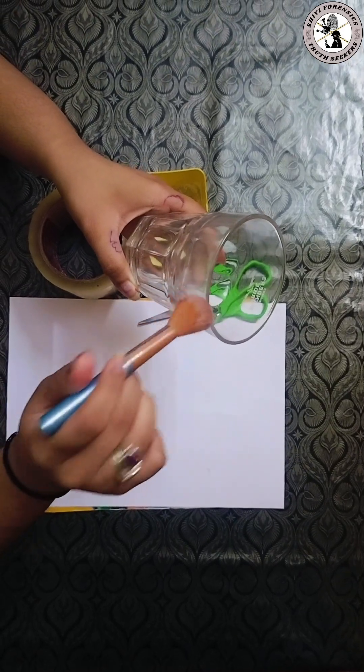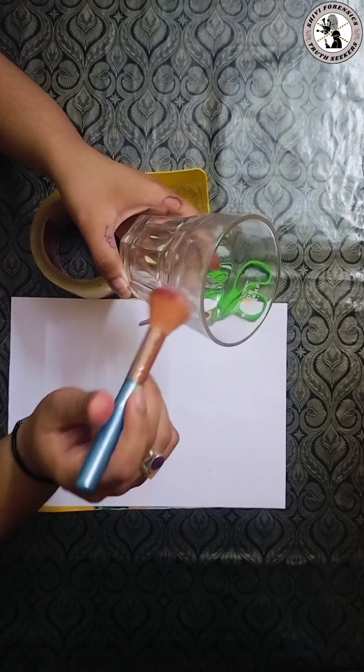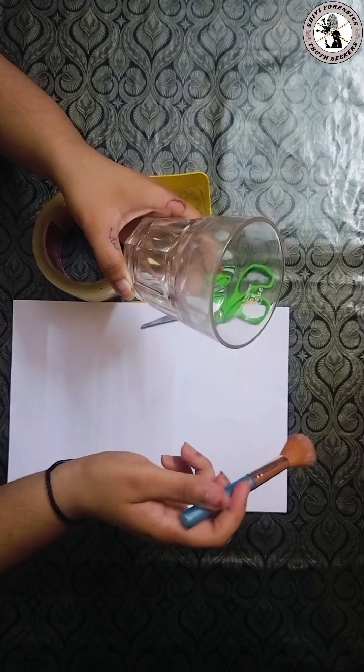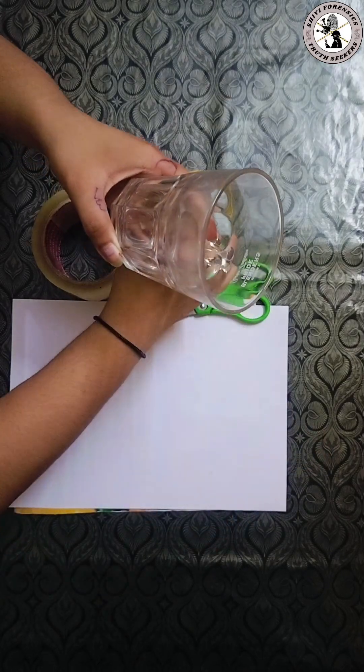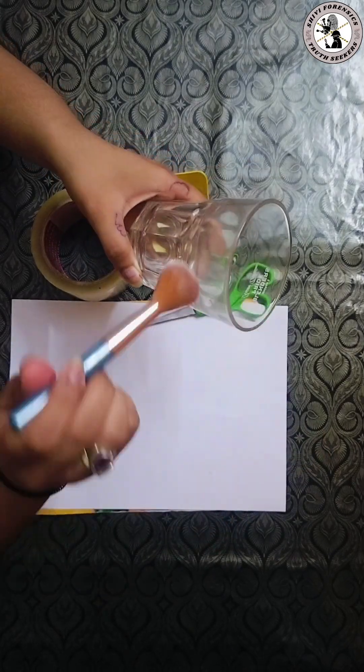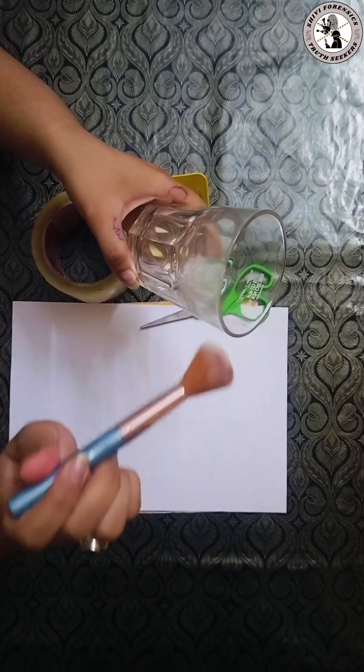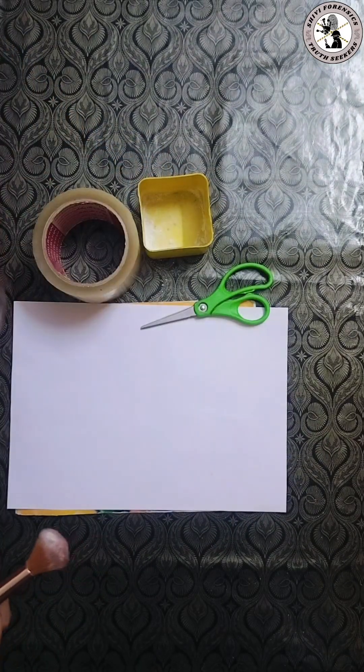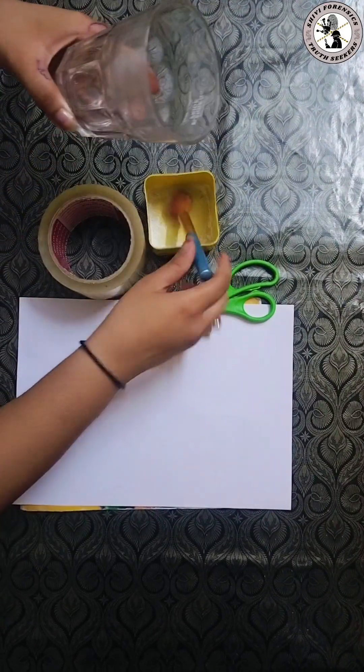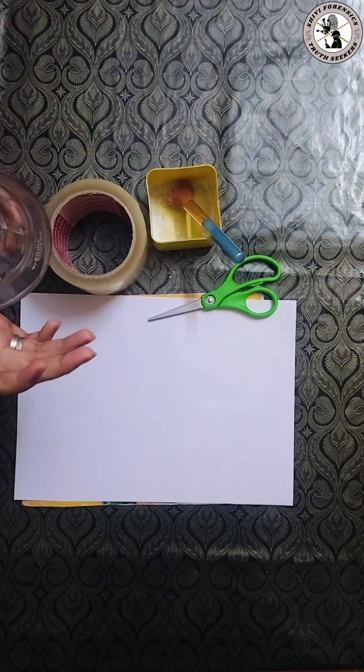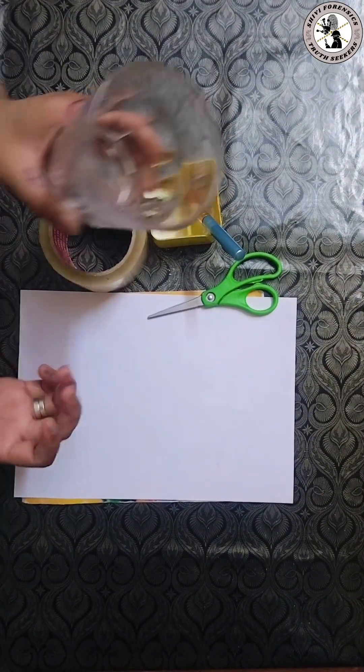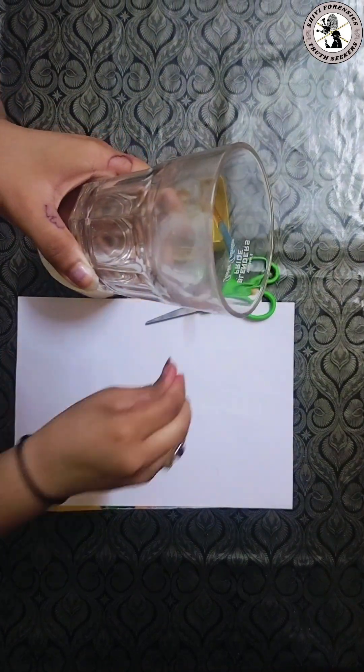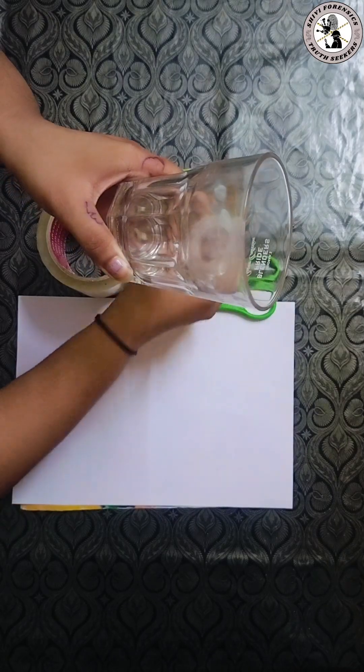Powder sticks to the hidden fingerprint. Blow off the extra powder. As you can see now the print becomes visible.